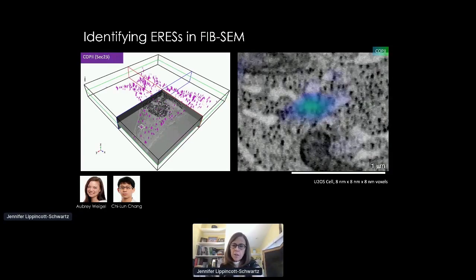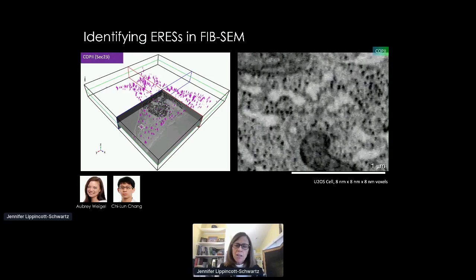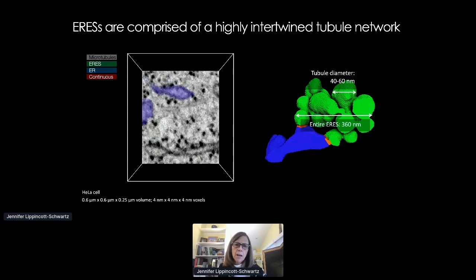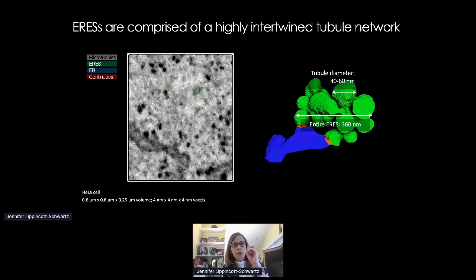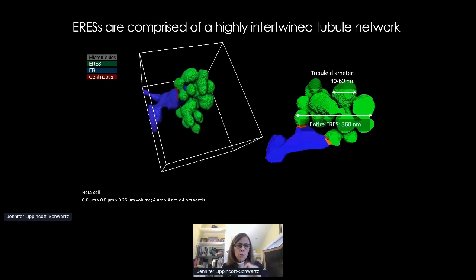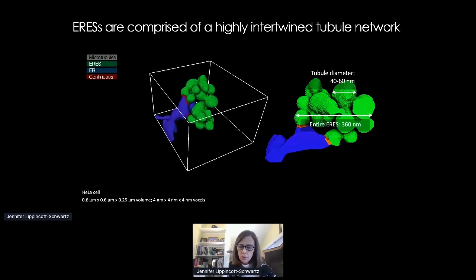And so the fluorescent image that you're seeing is the COP2 SEC23 structure. Now, basically, what we could do from that is to begin reconstructing ER exit sites throughout the cell using the characteristic morphology of these structures. We could then start going even into untransfected cells to map out, at FIB-SEM resolution, the structure of these sites.